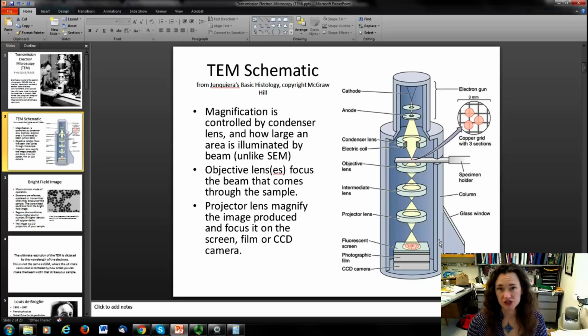There's whole courses where people learn how to prepare samples for microscopy, especially in biology, where sample preparation techniques take up a lot of time, okay? So basically you have to slice really thin sections of your sample off if it's a bulk sample. And if it's something like nanoparticles, for example, they also have to be carefully prepared.